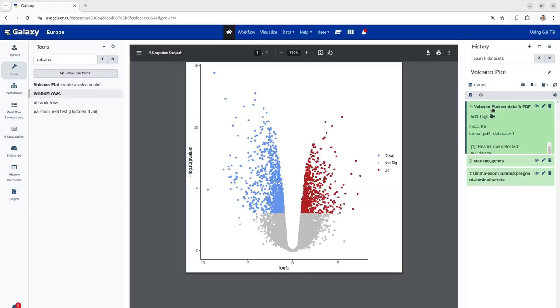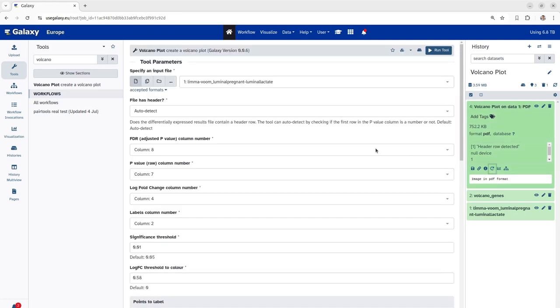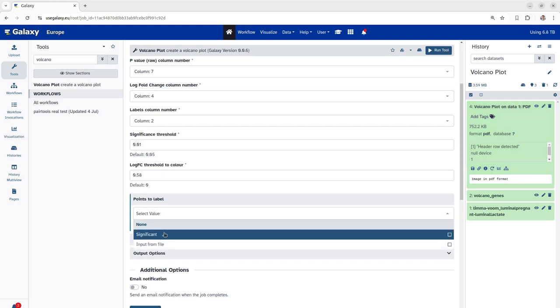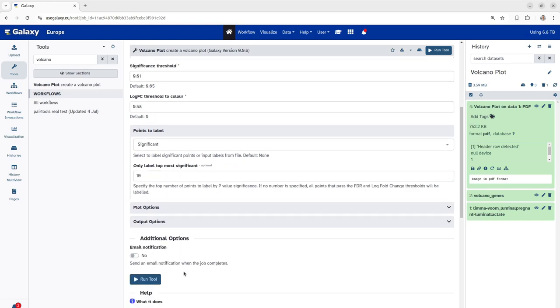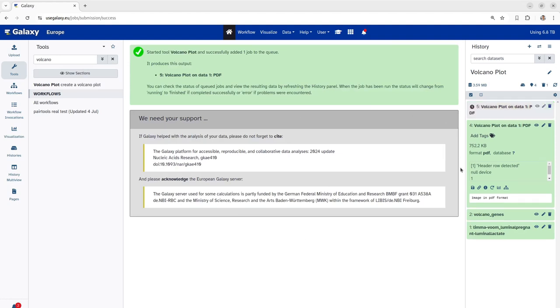So, this is our tool which was used to create the volcano plot. All you have to do is click on this run job again which shows you all the tool parameters which you have specified in the present run. Next, we have to just change the points to label to significant and we have to specify how many significant genes or gene labels you want to visualize on the volcano plot. In this case, we would choose to specify 10 highly significant genes to be visualized on the volcano plot. Now, we will again click on the run tool button and wait for this job to get completed.